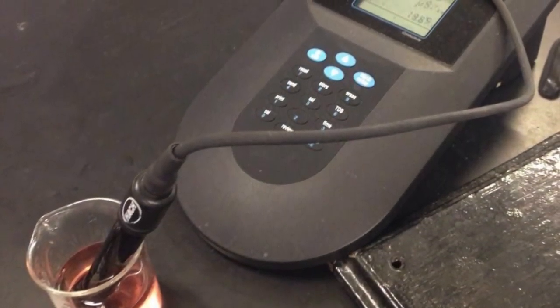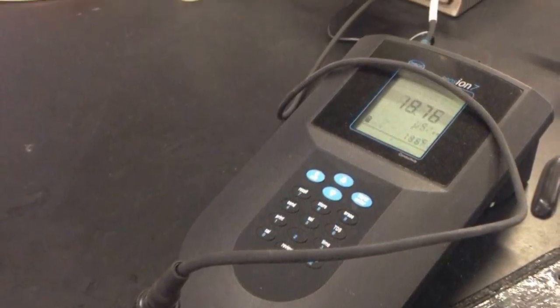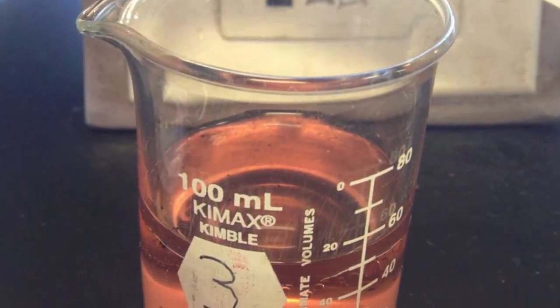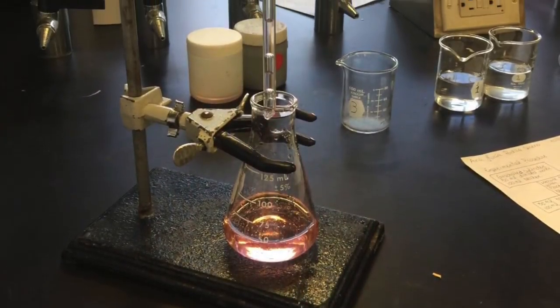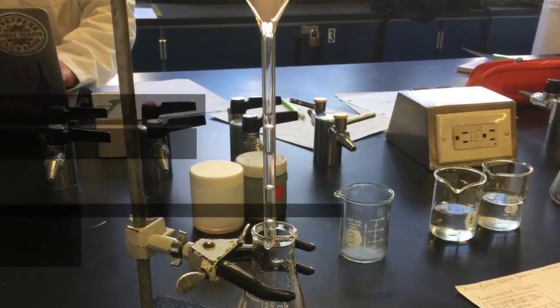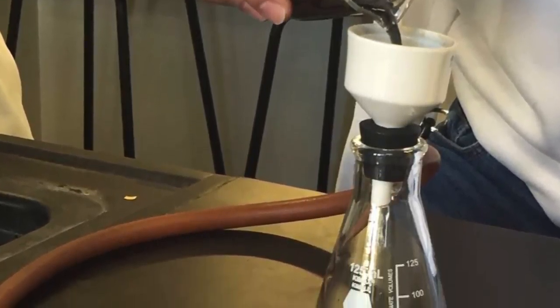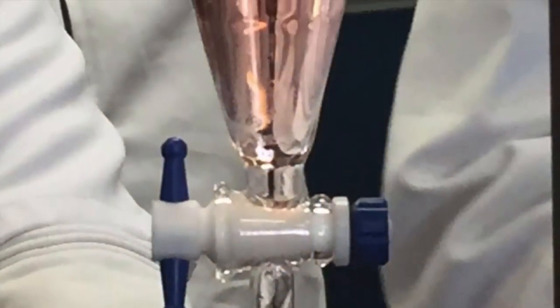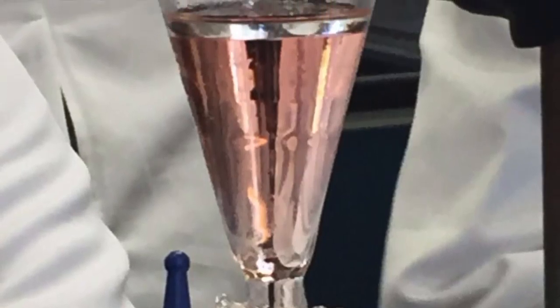The first practice was filtration, decantation, and absorption. In this practice, we had three different samples of water. We had distilled water, tap water, and polluted water, and we performed different procedures to purify them. First, before doing the procedures, we measured conductivity and pH, and then after performing the procedures, we measured these characteristics again to see how they changed.